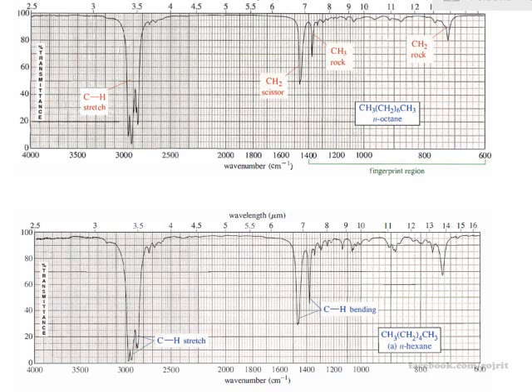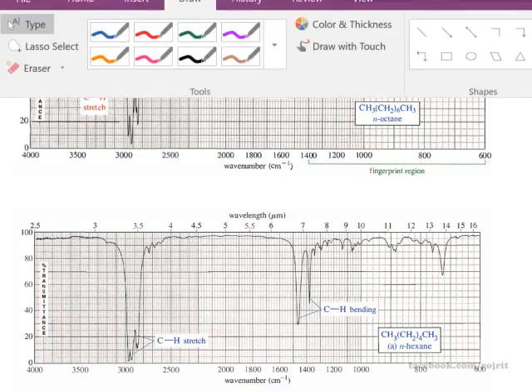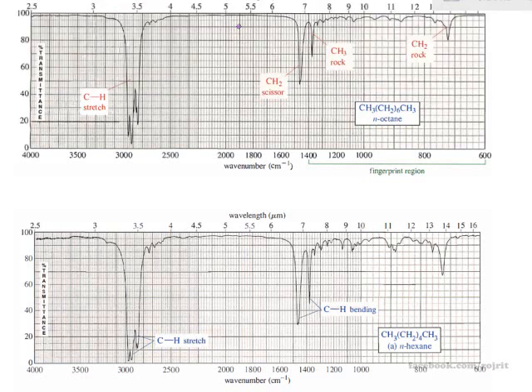After you can see the spectra of a compound, what you have to do first is identify the chemical bonding. But what kind of chemical bonding can you observe here? First of all, as I said, there are fields of characteristic positions on the graph. Here, what can be easily noticed is the 3000 wavenumber.